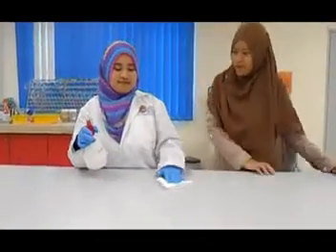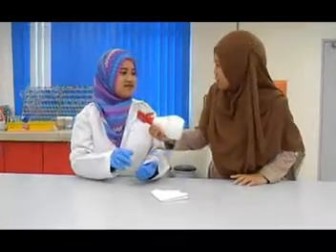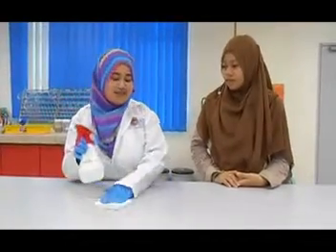Nick, what are you doing? Well, right now, I'm sterilizing my workplace with ethanol. Ethanol? Yes. Well, as you can see, ethanol is one of the chemicals that can be used in sterilizing the laboratory apparatus. Oh, I see.